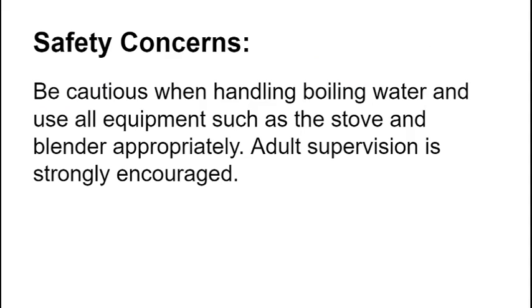When conducting this experiment, following the previously stated procedures, be cautious when handling boiling water and use all equipment appropriately. Adult supervision is encouraged if you are underage.